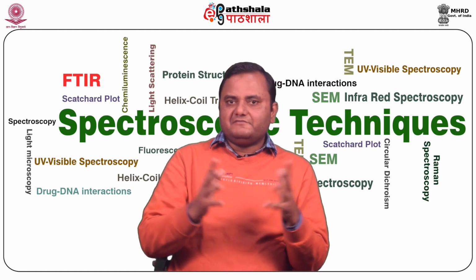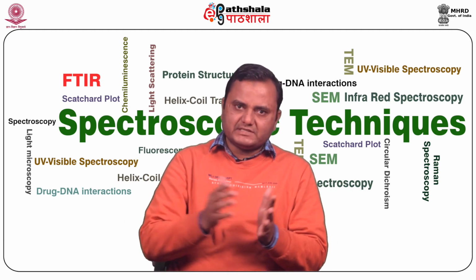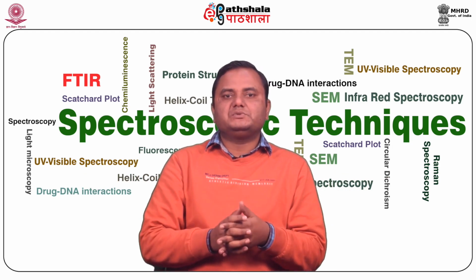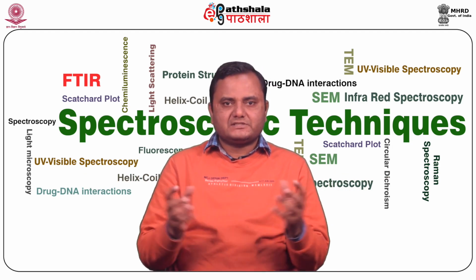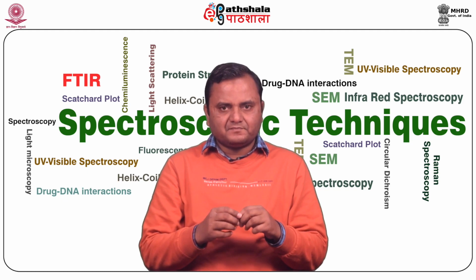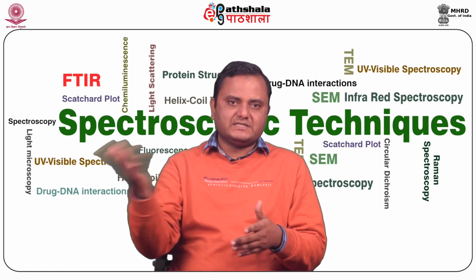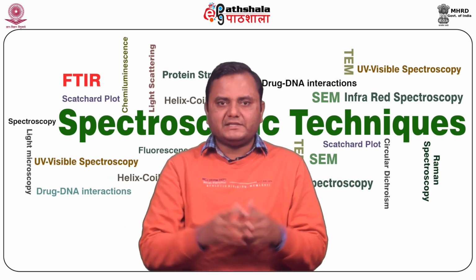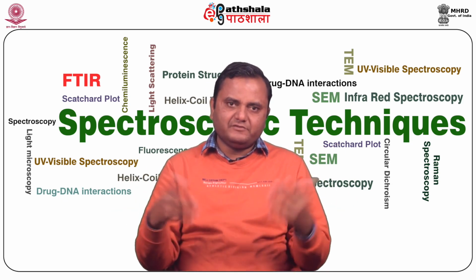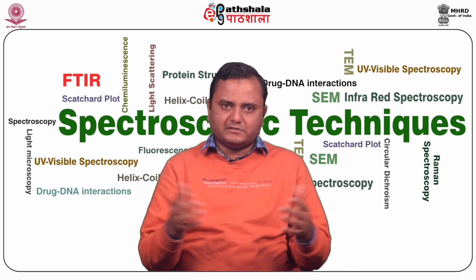Now we know why we use fluorescence spectroscopy. What are the major advantages associated with fluorescence spectroscopy as compared to other spectroscopy? The first reason is its high sensitivity, especially towards the local medium. A slight change in the medium can lead to a dramatic change in the spectrum, which can easily be detected. Changes in polarity or hydrophobicity can change the fluorescence spectrum, which can give you information about the structure, stability, and molecular environment of biological molecules.